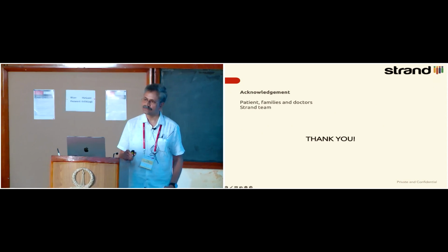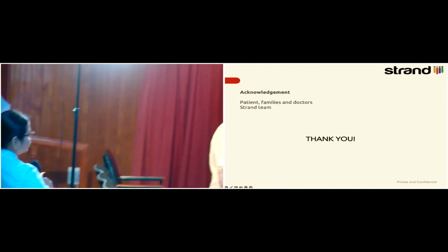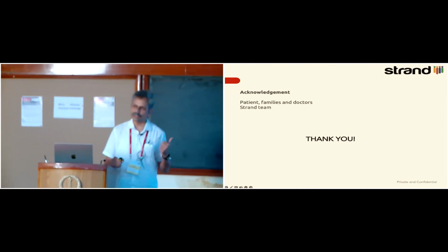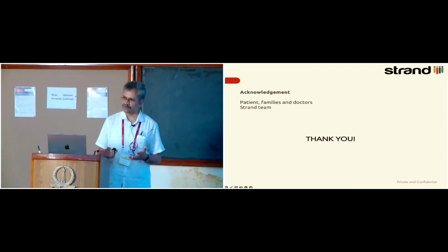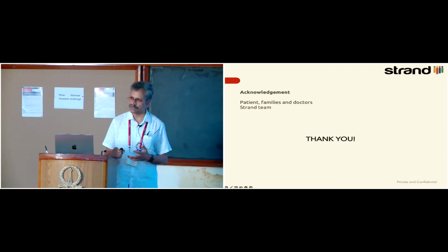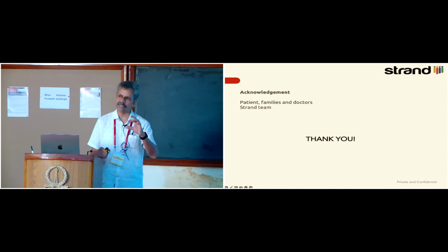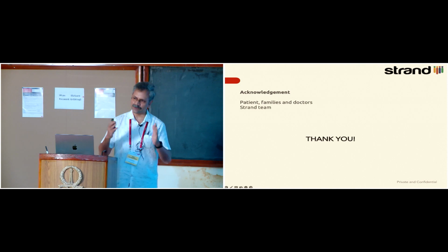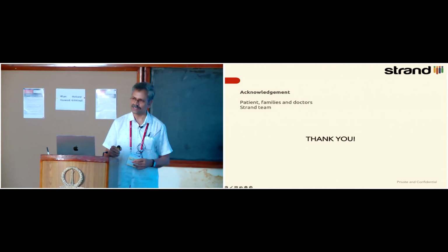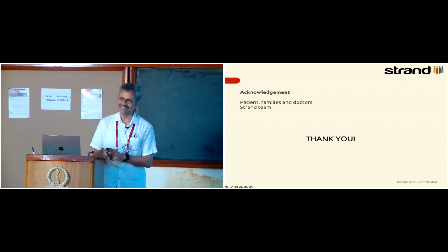Okay, so it can also be applied to plants, right? You could do it on plants also. Now here, most of the analysis implicitly had the assumption that there are 2 copies. In plants, you'll sometimes have 6 copies of a chromosome, I think in the grasses. Yes, sir. And you'll have to see whether you can detect a change from 6 copies to 7 copies. The signal will be a little bit more muted, so to control that variance, you'll have to generate data at a higher coverage. So you'll have to work based on the ploidy of the plant, but I can do it. Okay, thank you, sir.